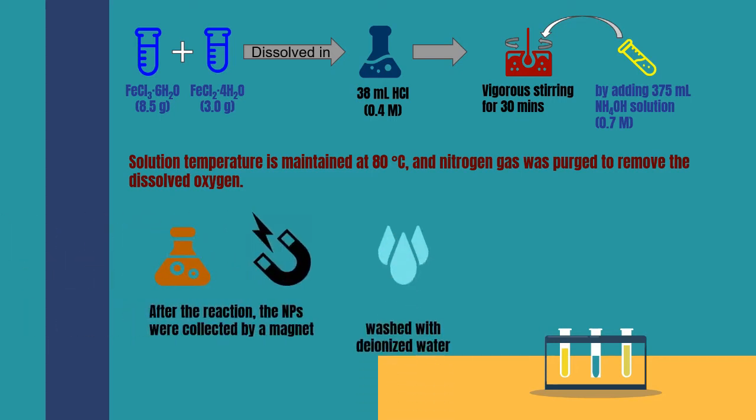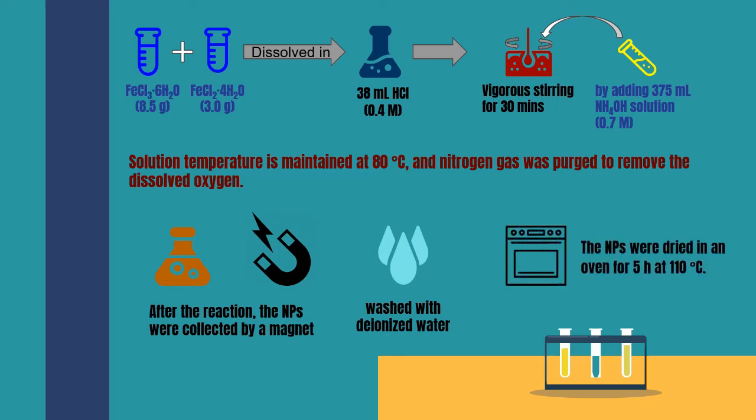After the reaction, the nanoparticles were collected by a magnet and thoroughly washed with deionized water to remove excess amounts of ammonium hydroxide. Then, the nanoparticles were dried in an oven for 5 hours at 110 Celsius.